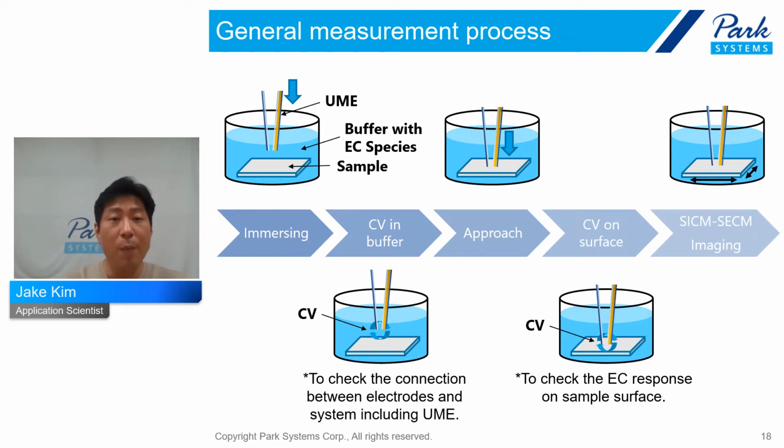The UME approaches the sample surface and measures the CV again on the sample surface. Then the EC response on the sample surface can be monitored. After checking the bias at which the EC response occurs based on the CV result on the sample surface, the SICM-SECM image is performed while applying the corresponding bias voltage.